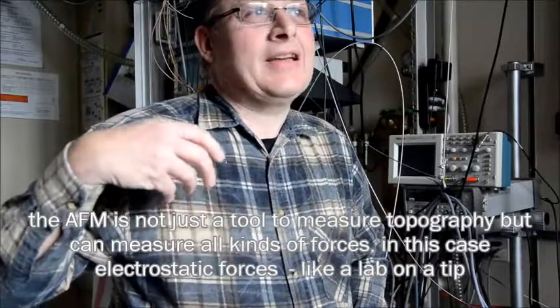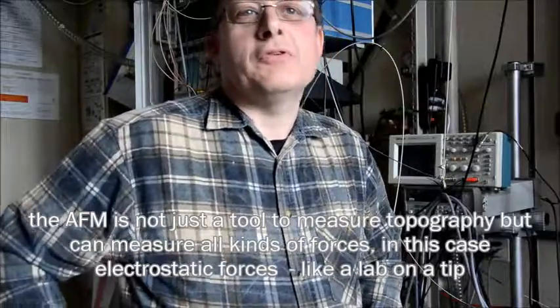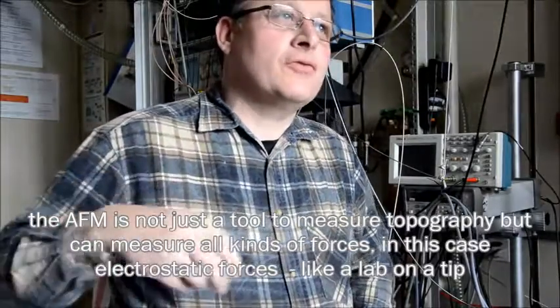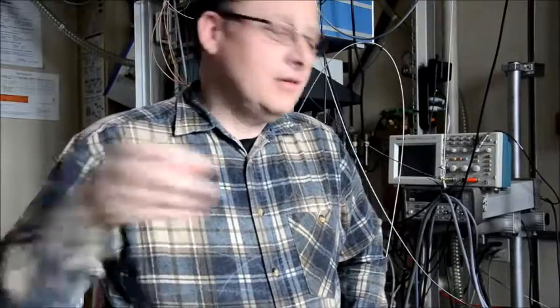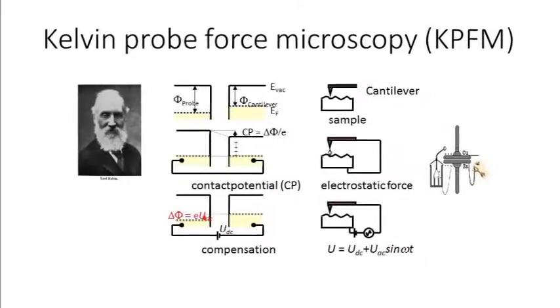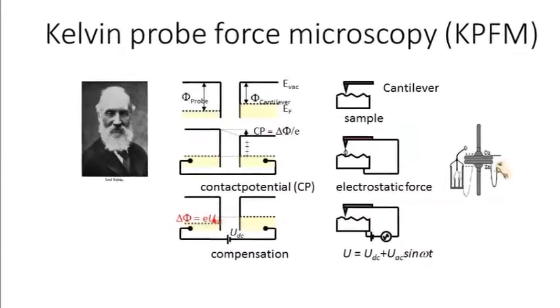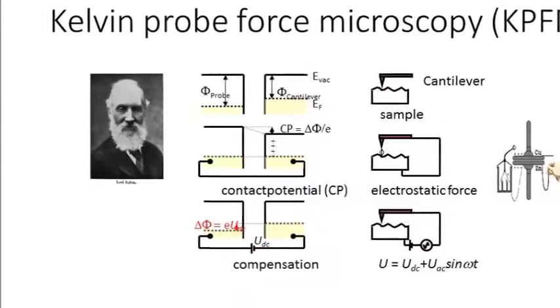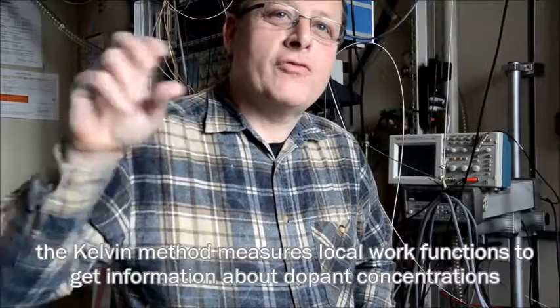So it's a bit like a lab on a tip, so it measures forces, all kinds of forces, friction forces or electrostatic forces. In this case, electrostatic forces, and also we can measure local contact potential differences, which means that we use this Kelvin method, originally introduced by Lord Kelvin, to measure these local work function differences.